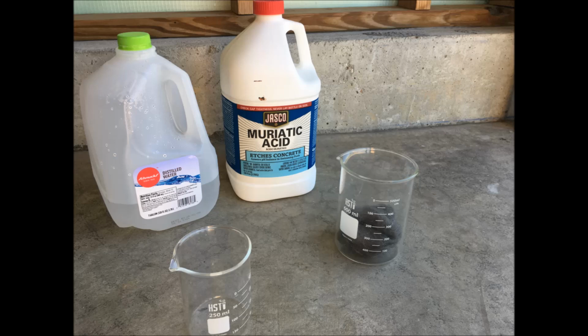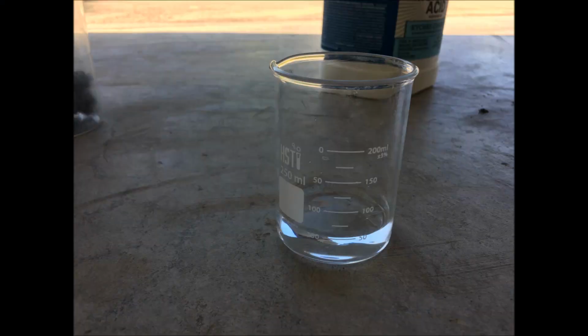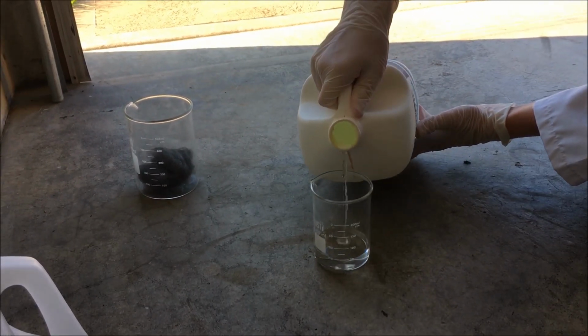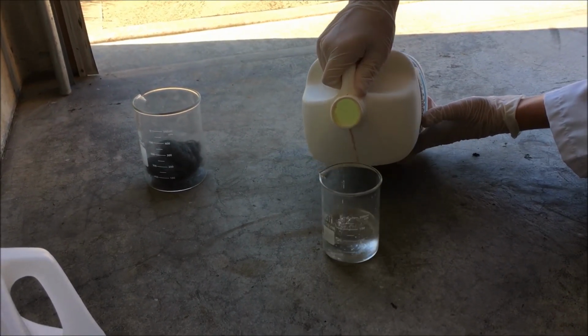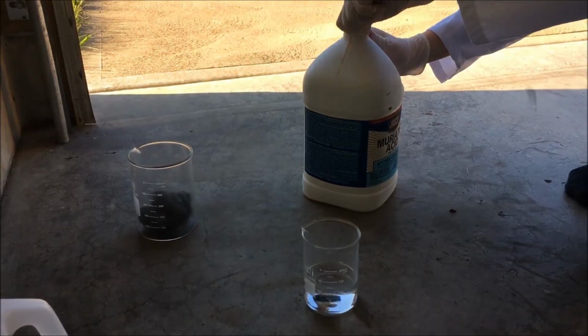To make it, you will need 32% hydrochloric acid, steel wool, and distilled water. Start by adding 50 milliliters of water into a beaker. Then add around 60 milliliters of the hydrochloric acid into the water and then stir it around.